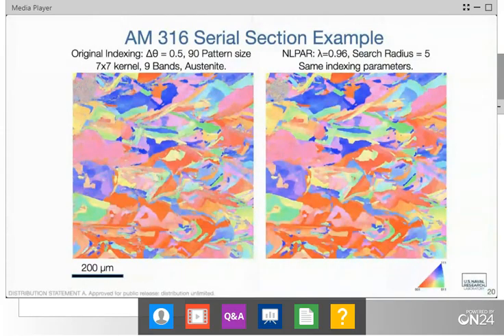If I am suggesting to somebody today, what would I use? I would use Python with a combination of NumPy and SciPy and those types of things. It's come a long ways. In fact, I'm translating a lot of my codes over, but still all of this reconstruction data is done within IDL. But really, it's a replication of a lot of the EBSD routines. These IPF maps are made using that software, using the standard triangle for coloring, those types of things. They're just re-implemented inside of IDL.